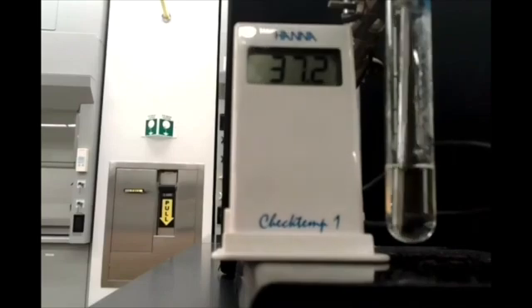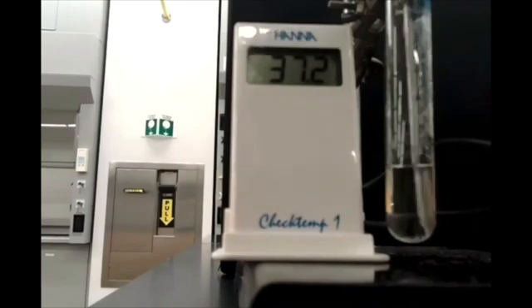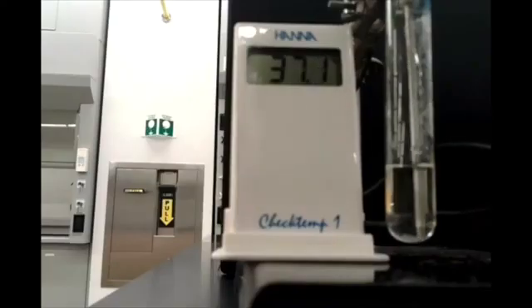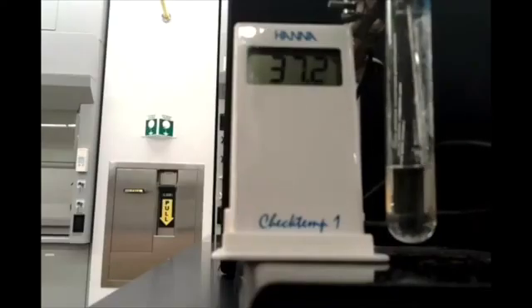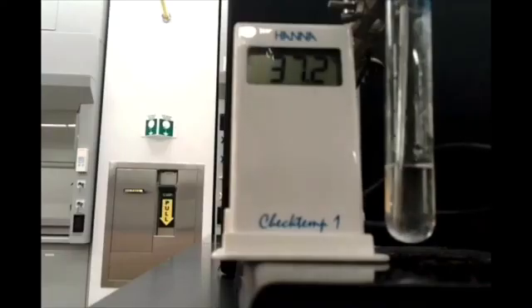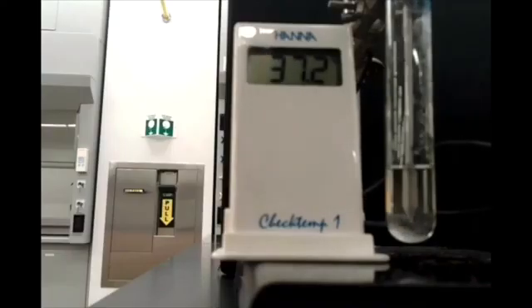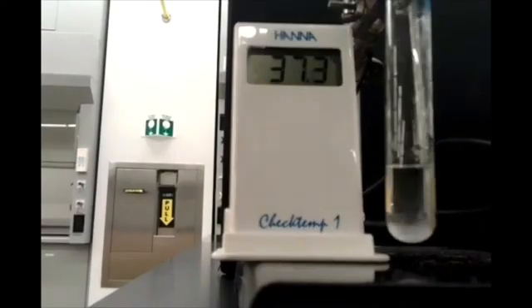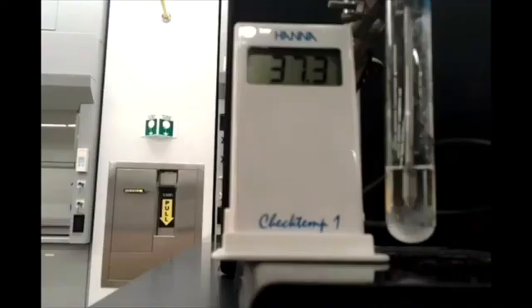That's something interesting. Notice the little crystals that are there at the bottom. Oh yeah, there we go. See these crashing out of solution.